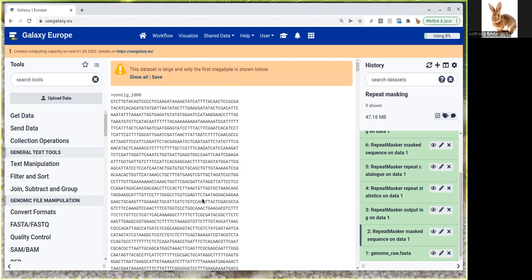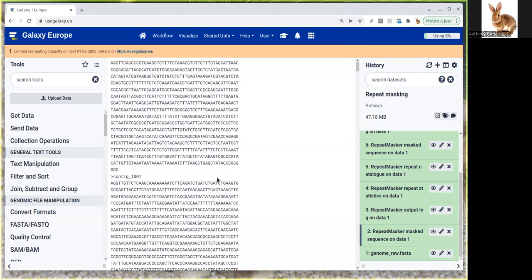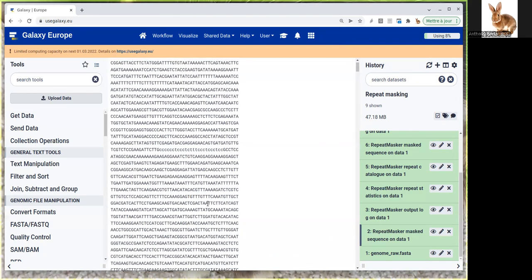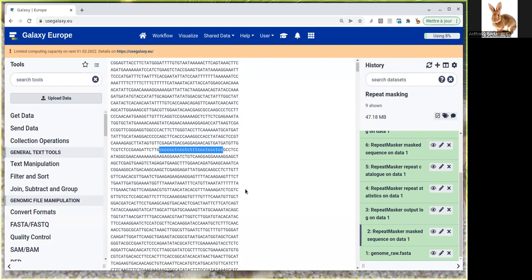That's what we call soft masking, because the regions that are repeated are just put in lowercase, but you still see the sequence at this position in the file. Other annotation tools we'll use in the FunAnnotate or Maker tutorials will take into account this information that this sequence is repeated in the genome.